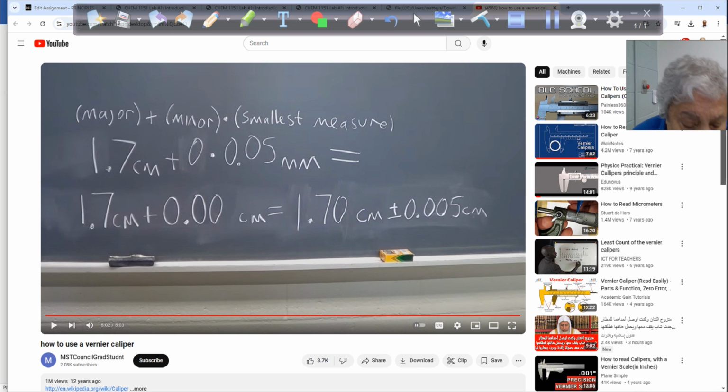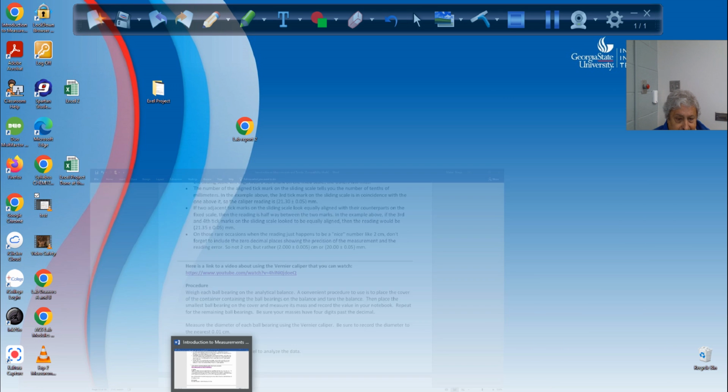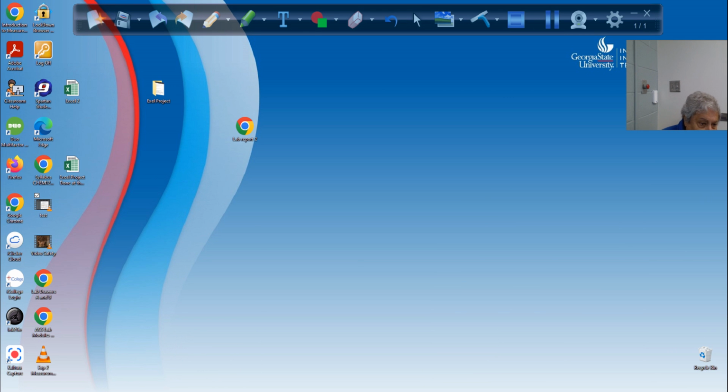Now with this one here, you will make an Excel file. You do it at home, and I have one Excel file for you. I hope I have it here. I think it's here. Let me see.